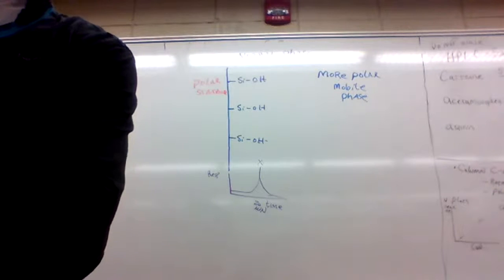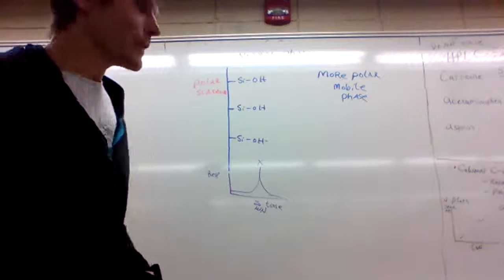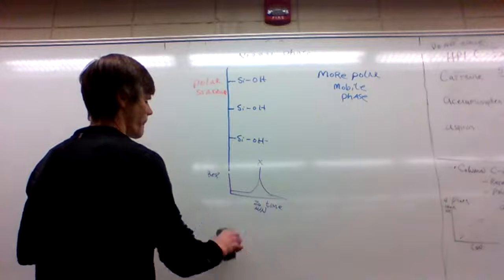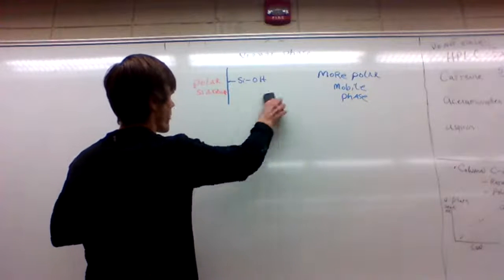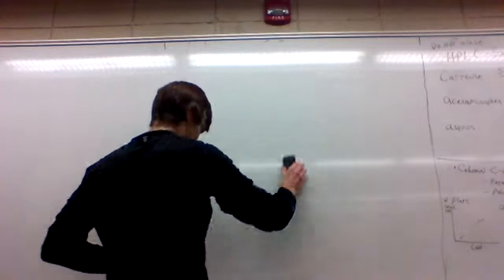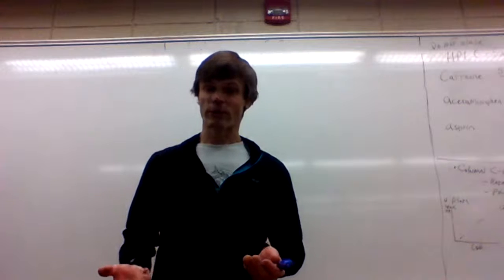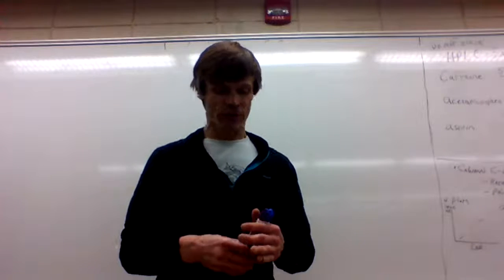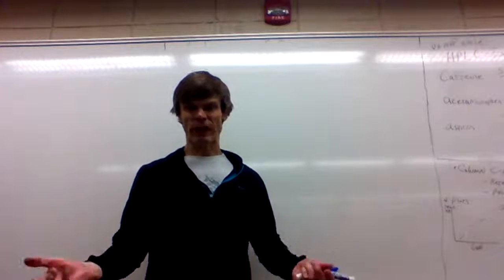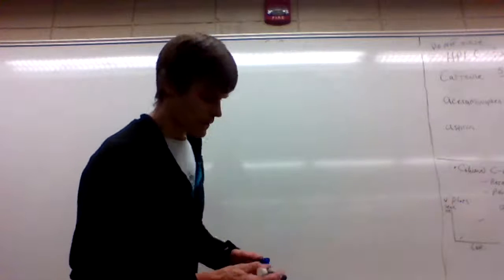We also have reverse phase chromatography. And this is the more common reverse phase. This is used more often because most of our non-volatile liquids are going to be fairly non-polar substances. A lot of them are long proteins or other types of biochemical substances that we would use in pharmacy.